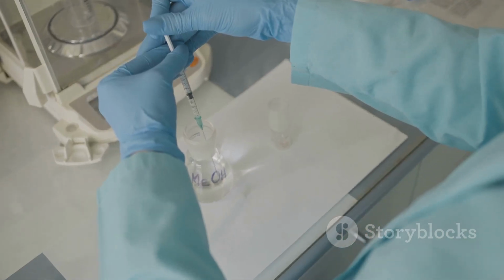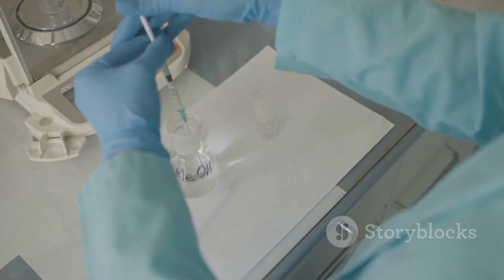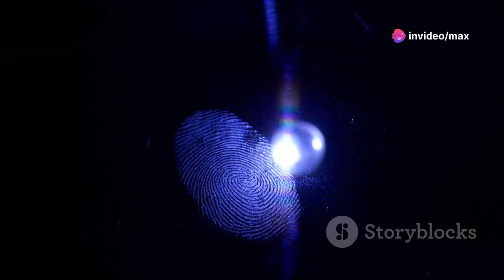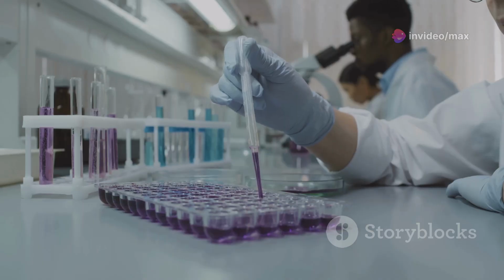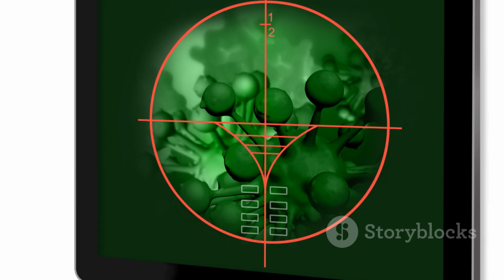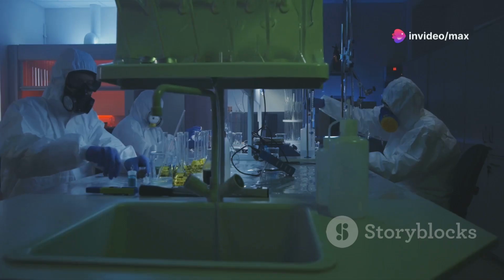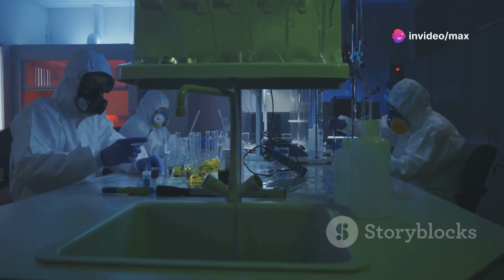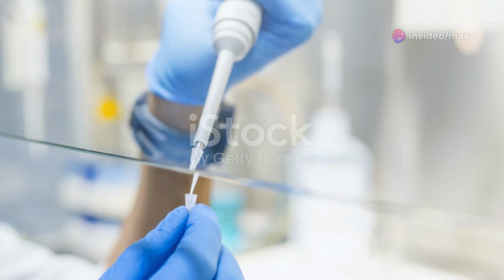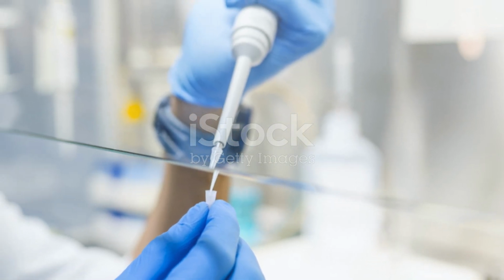ELISA is a test that detects and measures substances. These substances can be proteins, hormones, or even viruses. Imagine you're a detective looking for a specific fingerprint at a crime scene. ELISA is like dusting for those fingerprints, but instead of dust, we use antibodies. Antibodies are special proteins made by our immune system. They bind to specific targets like a lock and key. In ELISA, we use these antibodies to find our target molecule, our fingerprint, in a sample.